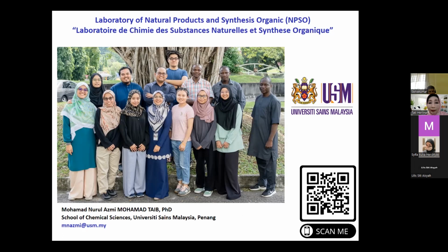For this one, what I can say is, for the beginner, anyone who doesn't have any experience, I strongly advise you to run your starting materials or intermediates in the same solvent that you use for your final products, and it will make it easy to compare or overlay. I hope I answered your question, from the beginner for the beginner only. If you are expert enough, it's okay.